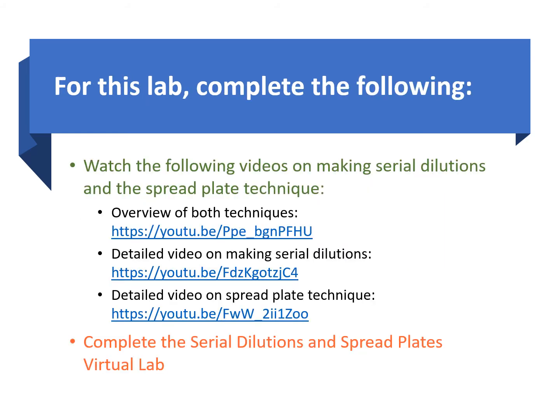There are actually some videos about how we make those dilutions. And by the way, we call them serial dilutions, okay? Because we usually do a series of them. We just don't dilute it once and that's it. Nope, we usually dilute our original sample several times. So that's why we call it a serial dilution.